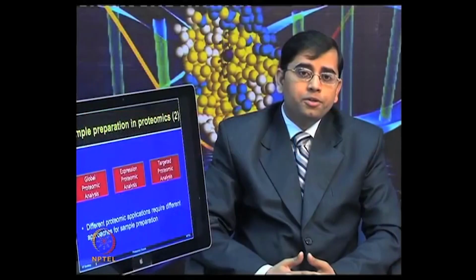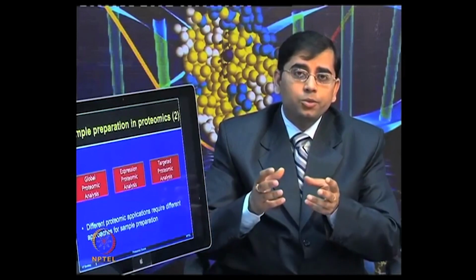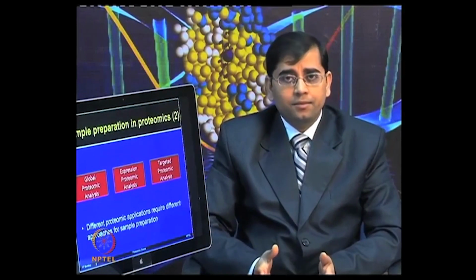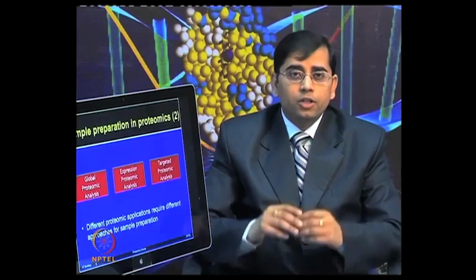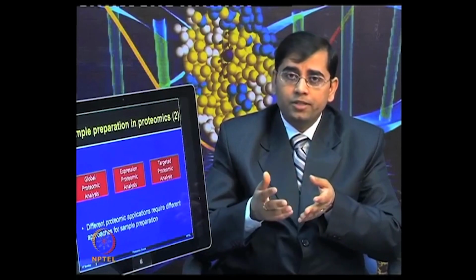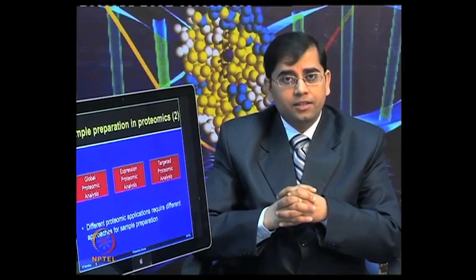When I am talking about global proteome analysis, it means your aim is to characterize all the proteins present in the given sample. Expression proteome analysis means you are mainly interested to look for those changes which are due to any chemical or treatment, those that are induced, either going up or down, where the protein amount is changing.